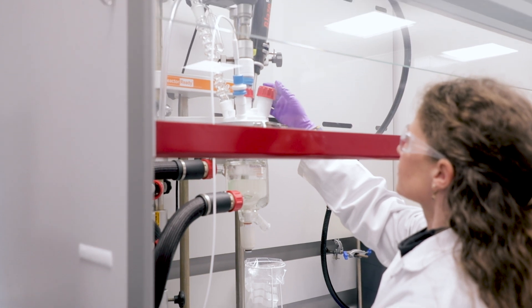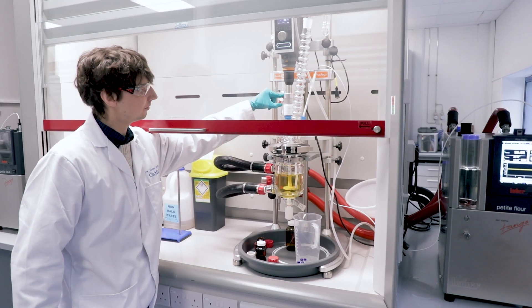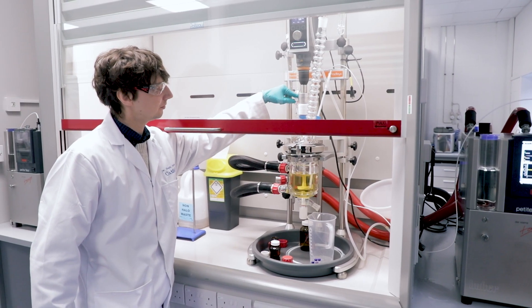One of the nice benefits of using Reactor Ready is just how easy everything is to piece together. Manually trying to set up a vessel is quite difficult and certainly, depending on your height, can be quite restricting. Being able to easily adjust your overhead stirrer, getting that set up appropriately, getting really nice agitation — you don't hear things clunking around and they run really quietly.